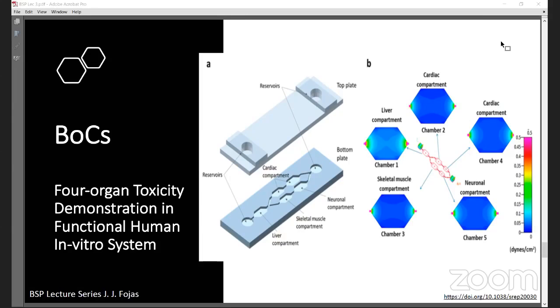Then the specific tissues in these chambers: the system is modular and reconfigurable, and organ modules can be substituted in the device. And then there is this gravity-induced flow. This was enabled by utilizing a rocker platform to generate shear stress on your cellular monolayers within accepted range. The cells could also be mechanically stressed, and flow as well could stress the cells. You can determine the flow rate and shear stress on the cells by the choice of your tilt angle.